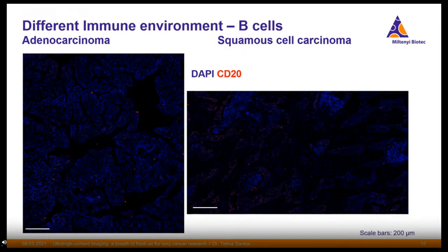This is very weird, first because it is not replicated in the other sample, and it is the same antibody from the same mixture and the samples have been handled the same way. So this is very curious. Of course, you cannot take any real conclusion out of it because further investigation would be needed, but I still wanted to show it because I found it quite interesting, and also because we have here a direct comparison of the markers. But let's take a closer look.